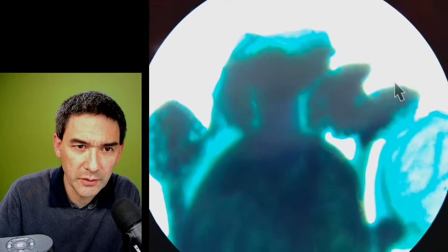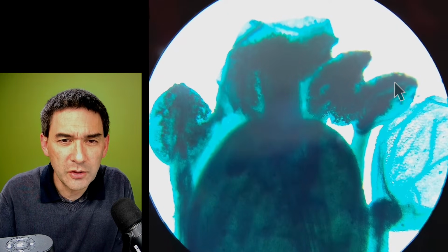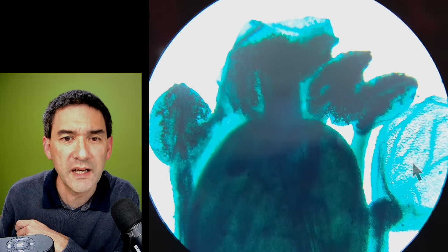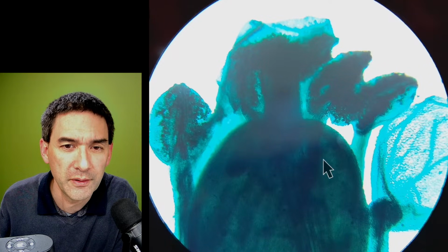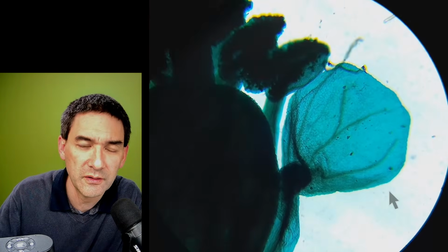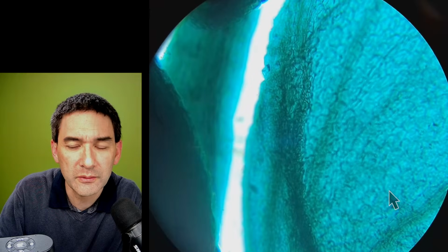Oh, it's also very dark. Okay. So that's a typical dynamic range issue. You see over here on the side it is of course overexposed because the central part is so dark. So the camera adjusts its exposure and turns up the exposure, and then some parts are overexposed. Now we're able to see the cellular structure a little bit. Here we go.